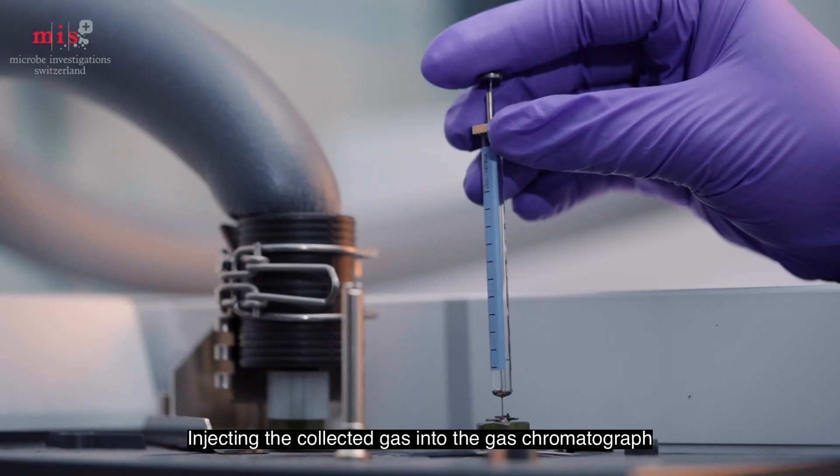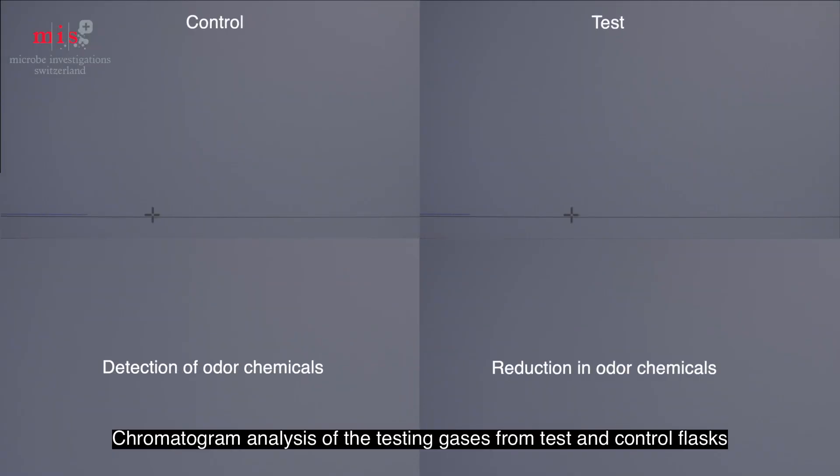The gas collected from conical flasks is injected onto the gas chromatograph. Difference in the peak area of testing gases from samples enables the determination of odor reduction rate.